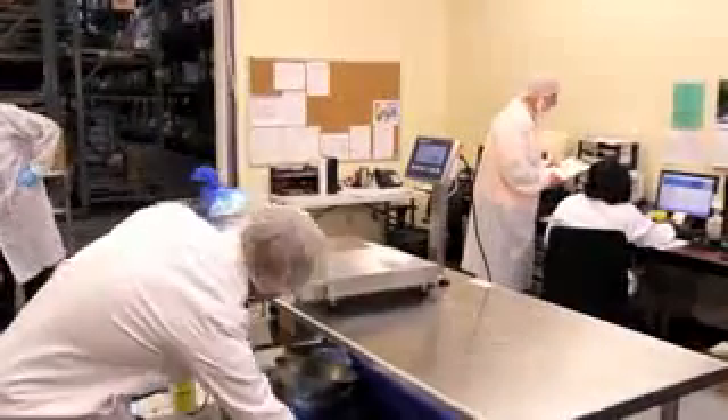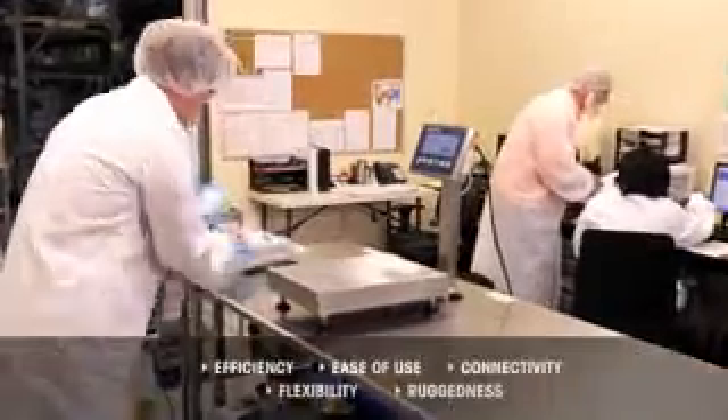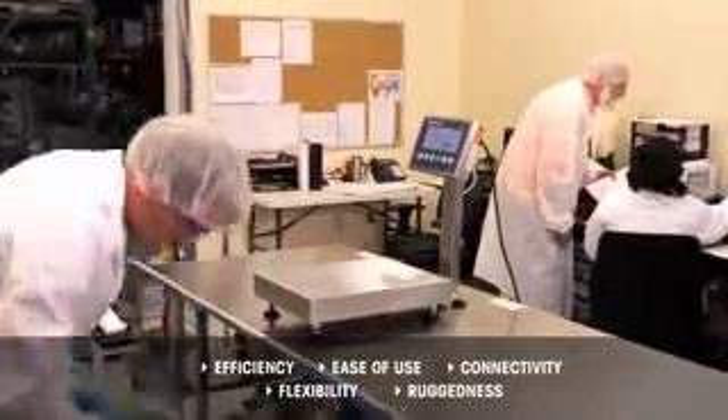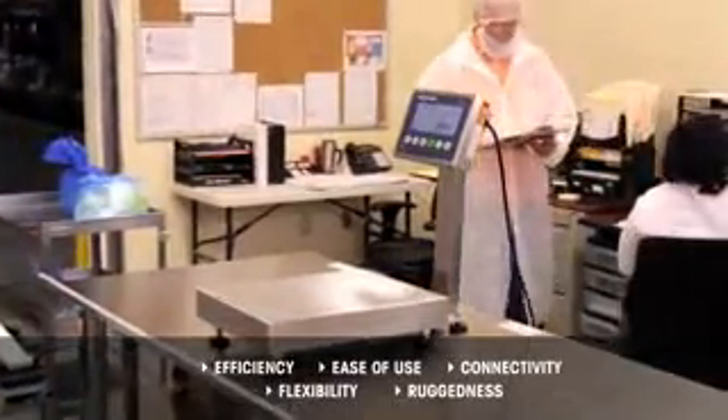The new IND231 and IND236 weighing terminals from Mettler Toledo enhance efficiency in weighing processes without compromising on ease of use, connectivity, flexibility, and ruggedness.